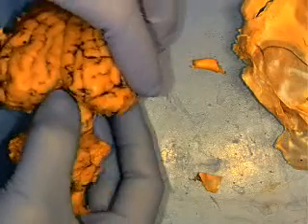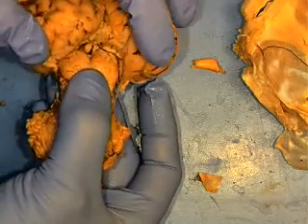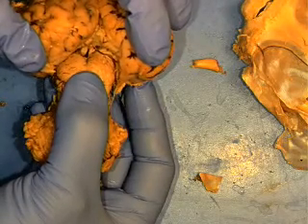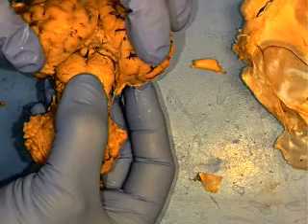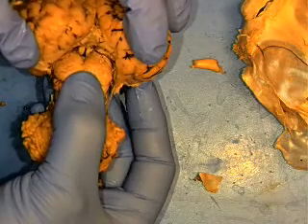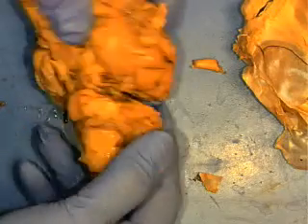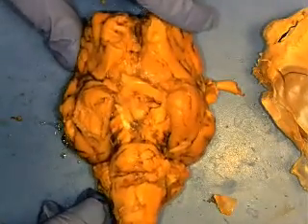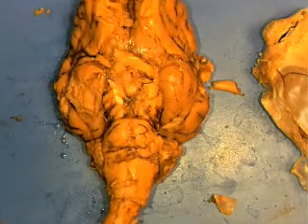Now if I take my thumb and pull back on the corpora quadrigemina, you see another little structure up there that appears, and that would be the pineal gland. It is an endocrine gland that releases melatonin to set up your biological clock, your sleeping and waking cycles. So let's go back to the ventral view of the brain, and let me show you the structures that you're responsible for there.